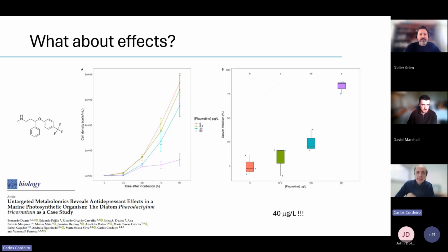So one immediate thing that fluoxetine does is that it is quite toxic to diatoms. You can clearly see that if you don't add anything, the cells will grow nicely, but if you start increasing the concentration, you actually have a very abrupt shift here. So you have two situations that are barely distinguishable from the controls, although you can already see that there is a decrease in the growth rate. But if you push to concentrations that are just slightly higher than what has been detected, then you have a dramatic effect. So if this affects growth, definitely it will affect metabolism.